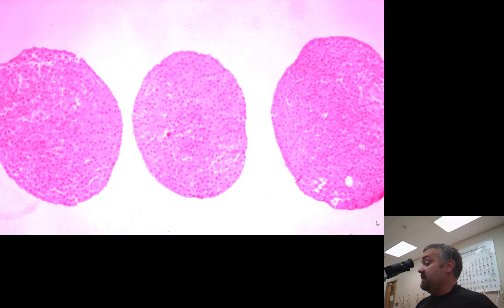The reason I really recommend this is that you are going to see very tiny structures, which is the point of a microscope, and you also can use this when you're learning about mitosis, which is the division of body cells, or truly the division of the nucleus.